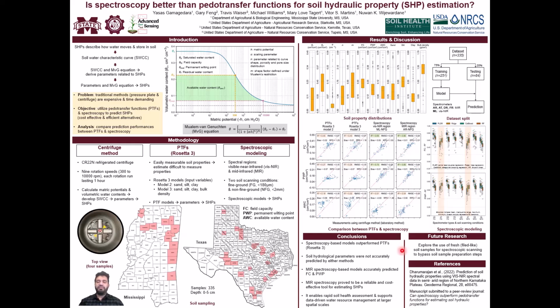From these findings, we can say spectroscopic-based models outperform Pedotransfer functions. And when we consider spectroscopic techniques, we can say the mid-infrared region outperforms the visible near-infrared region because the mid-infrared region can capture fundamental molecular vibrations while the visible near-infrared region can capture only overtones and overlapping peaks.